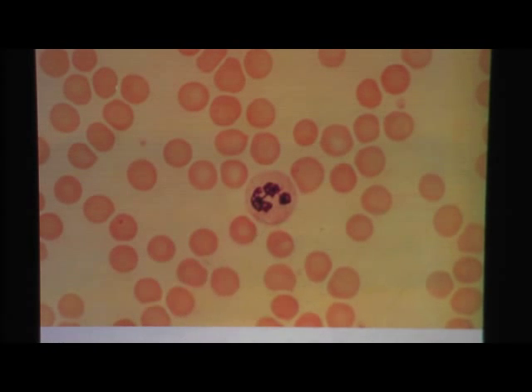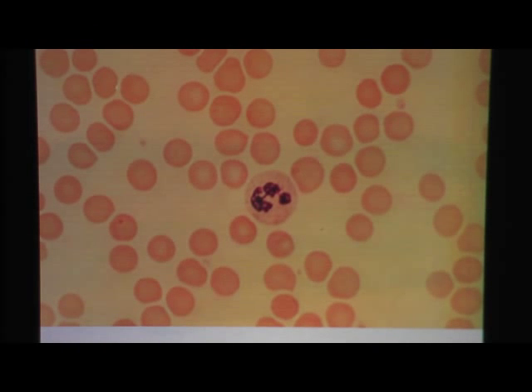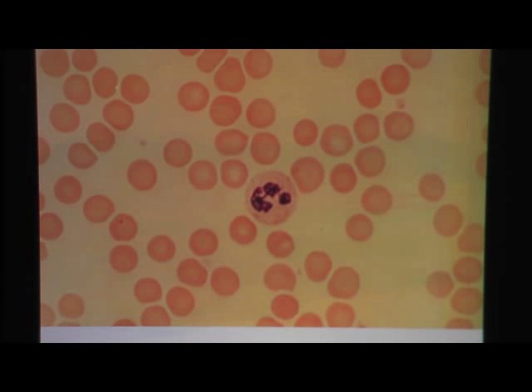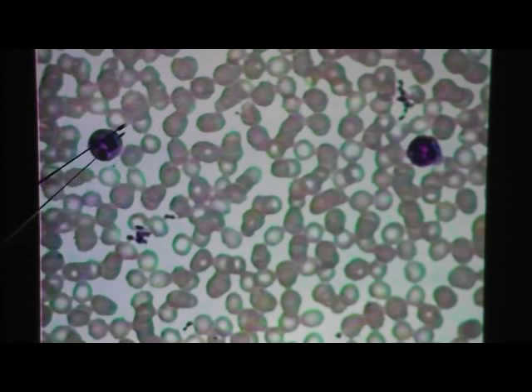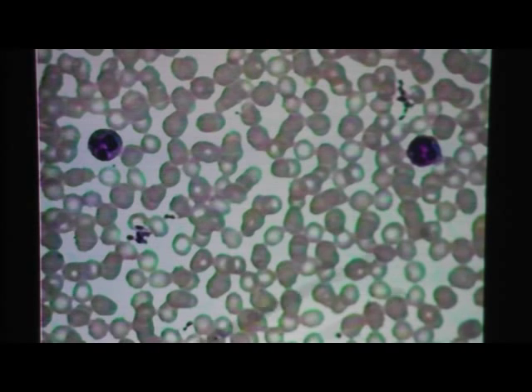White blood cells, on the other hand, are unique in that their nuclei vary. Sometimes the nucleus is very convoluted; sometimes it's just a dark circle making up most of the white blood cell. But either way, they're bigger than the red cell, they stand out, and it's easy to spot them. Here we have another image of blood. All of these are red blood cells, and here you see two white blood cells — they stand out like a sore thumb. You see a little bit of platelets around, and the white spaces would be blood plasma.